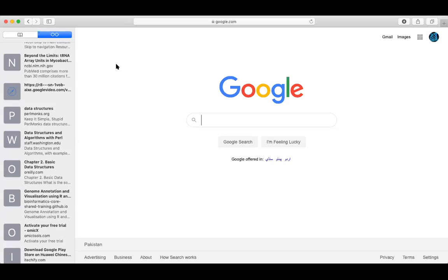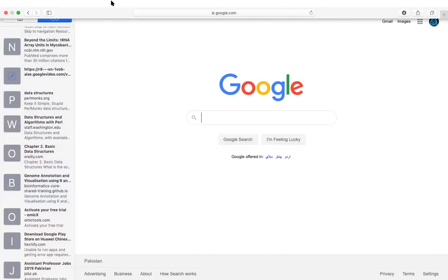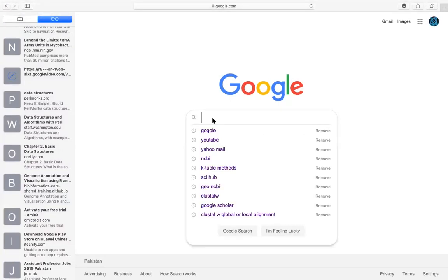I was thinking we will use ClustalW, because it gives progressive alignment, and we already discussed the two types of alignments. We will also use MUSCLE. Compared to other alignment tools, when you search on the web browser you will see a lot of alignment tools are present. So first we start — just need to write it, and it will show that it's a multiple sequence alignment tool.